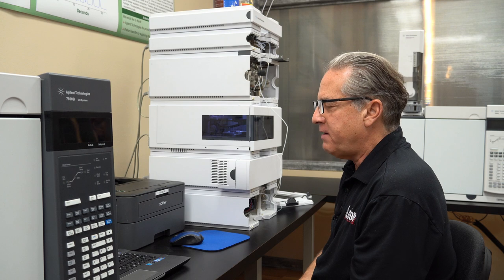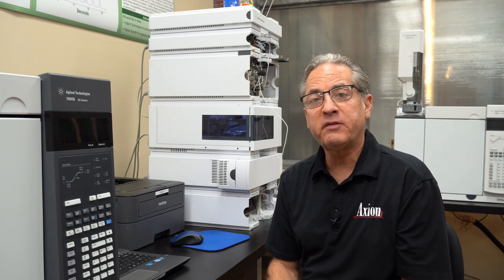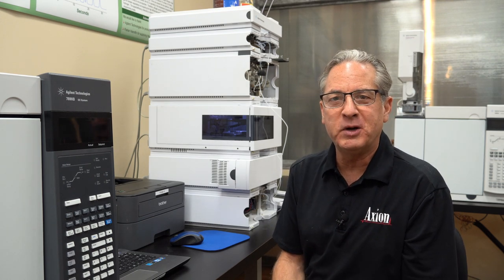It is by far the number one cause of problems in HPLC. It is a simple solution. Open the purge valve, turn the flow rate to 5 mL/min, let it sit there for 10, 20 seconds, and then back to normal flow rate, close the purge valve. That takes care of the number one problem you'll run into in HPLC.